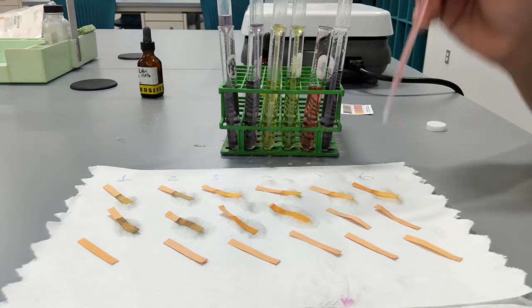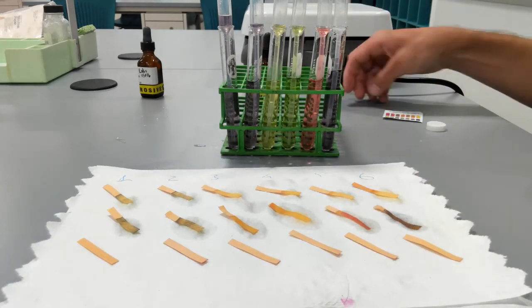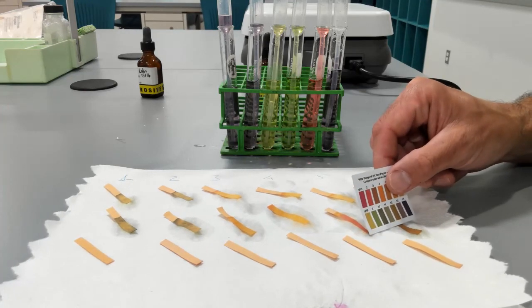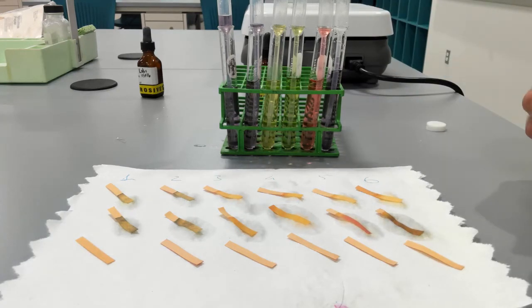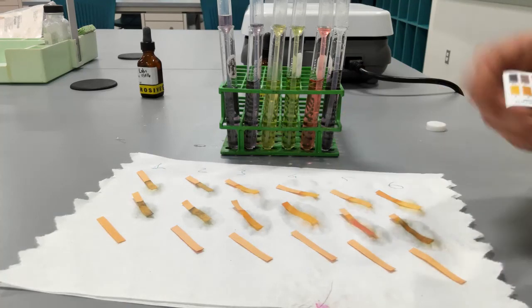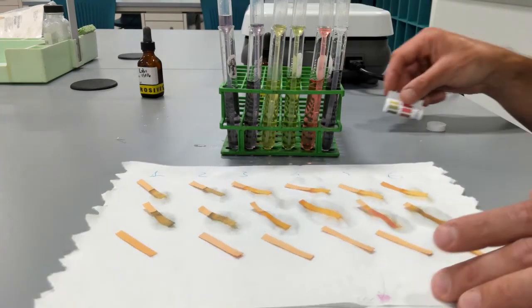And what about water? So this became dramatically more red, and this became kind of towards 10 to 11, maybe even 12. So 12 for water after the addition of sodium hydroxide, and it is closer to 2 after the addition of acid.